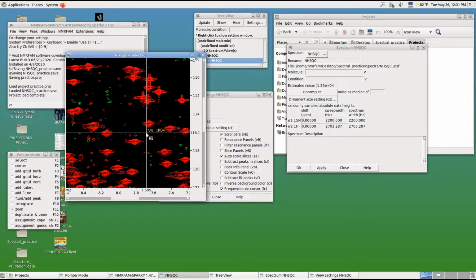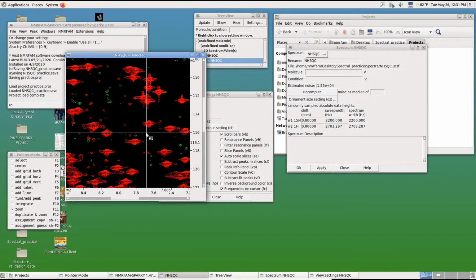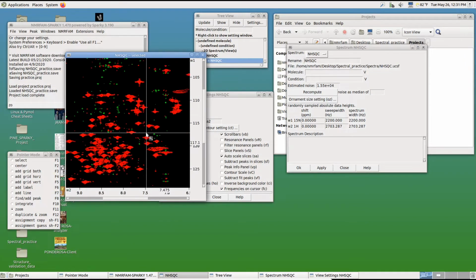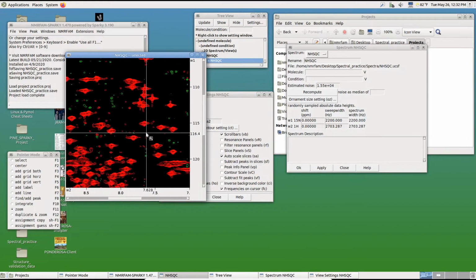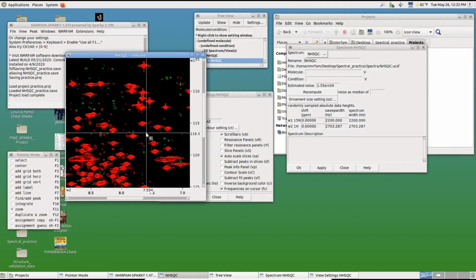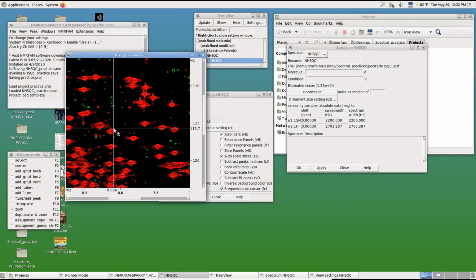And like I said, you can zoom in and zoom out by ZI, ZO. Or you can type plus or minus. It's a smaller step and you can feel it more continuous, and use your mouse wheel.